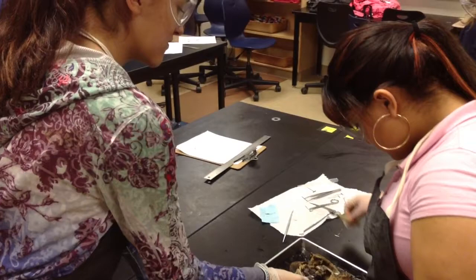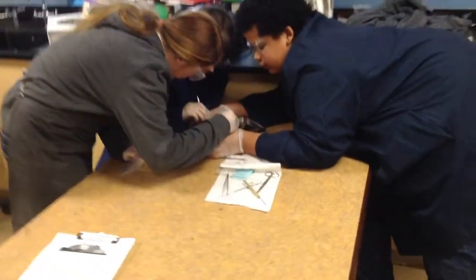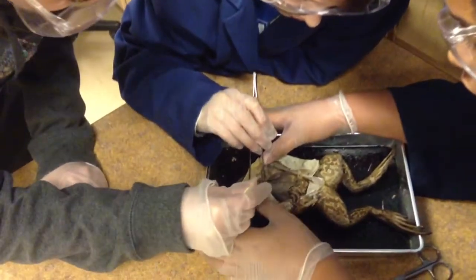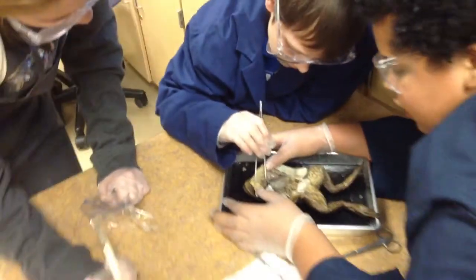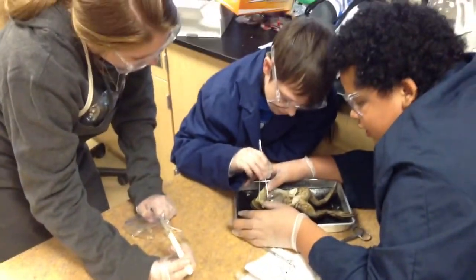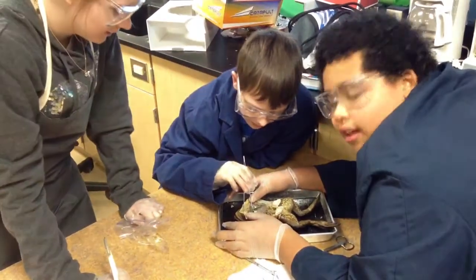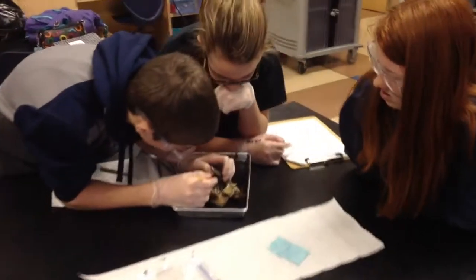You can use the scissors or the scalpel. What are you guys removing? I think you're cutting. It looks like a tongue. What are you guys removing? Liver? Liver?